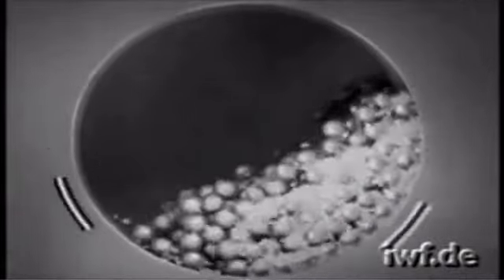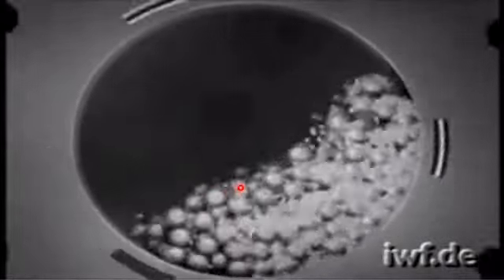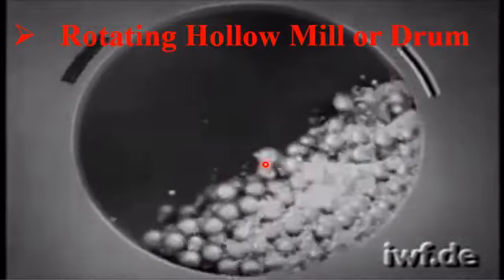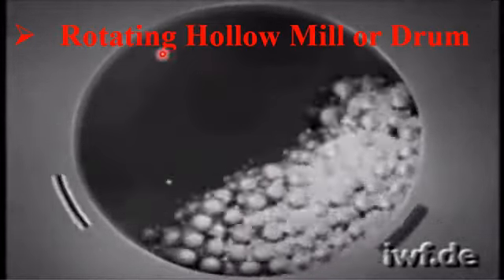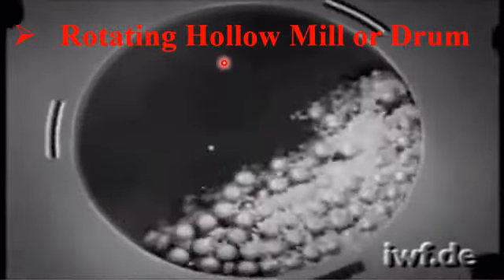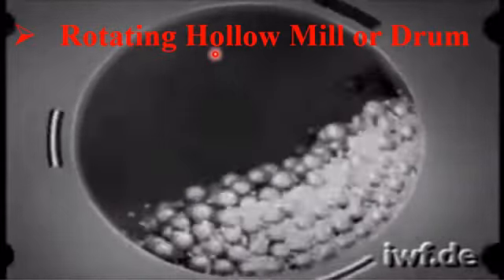Dear student, please note that usually a ball milling machine consists of a rotating hollow mill or drum. In this hollow drum, the bulk material, which is usually in the form of a powder, is incorporated.